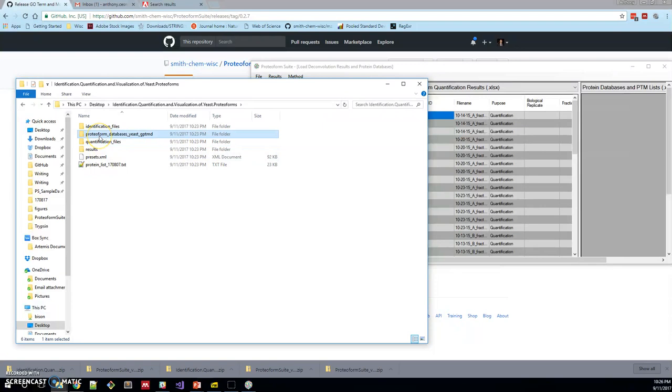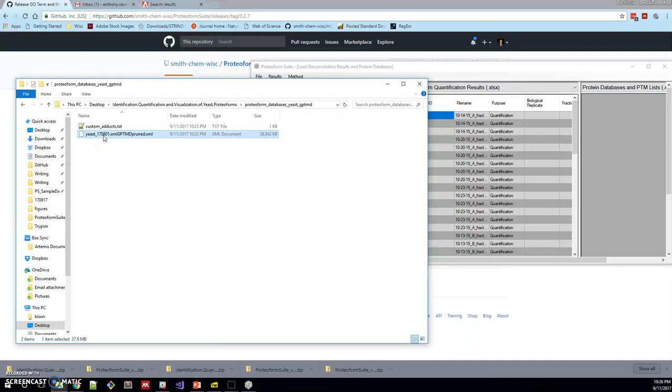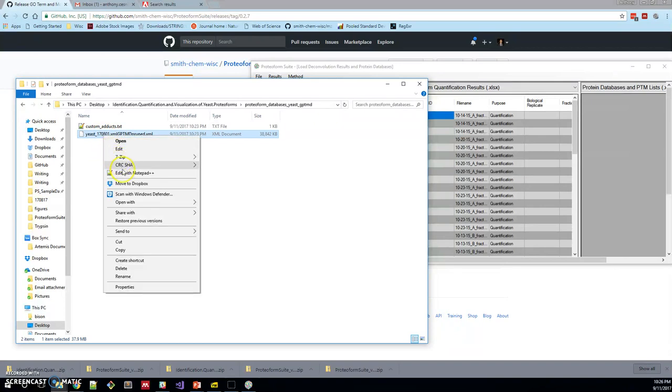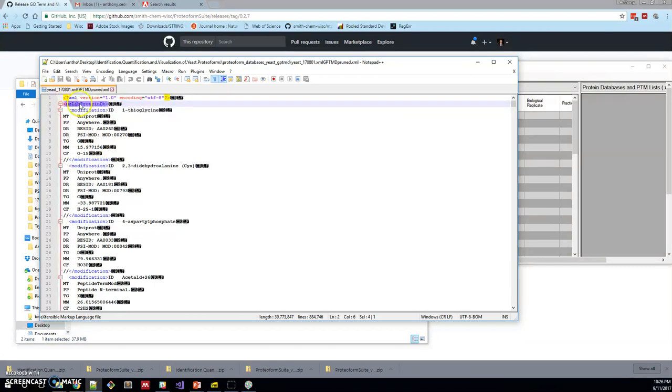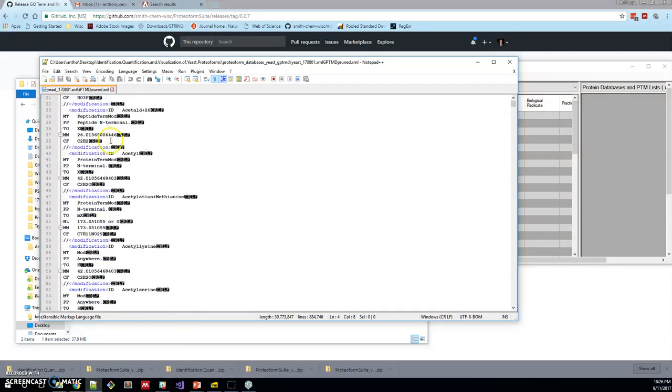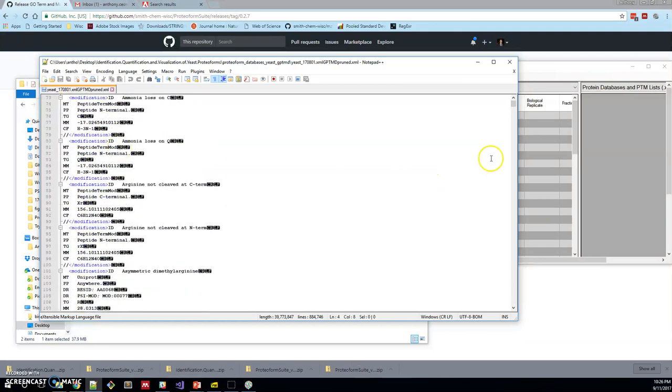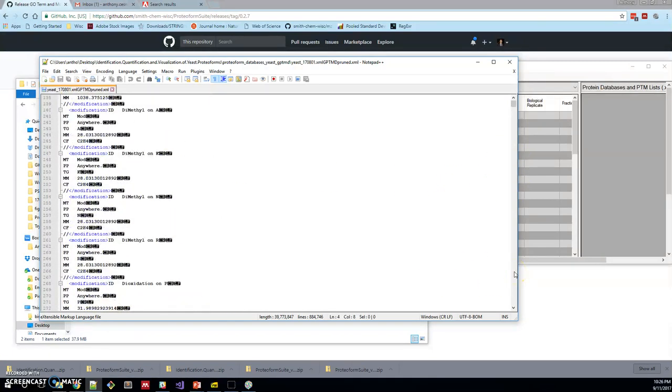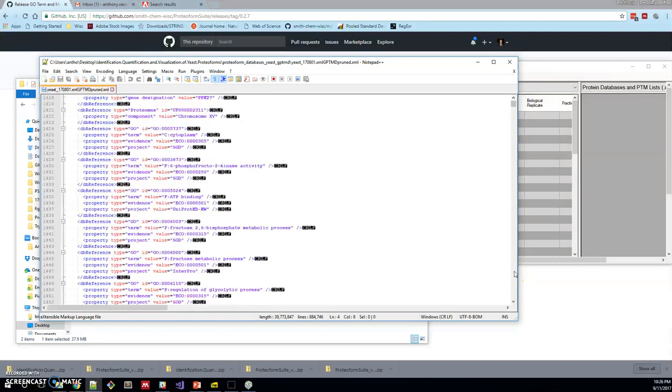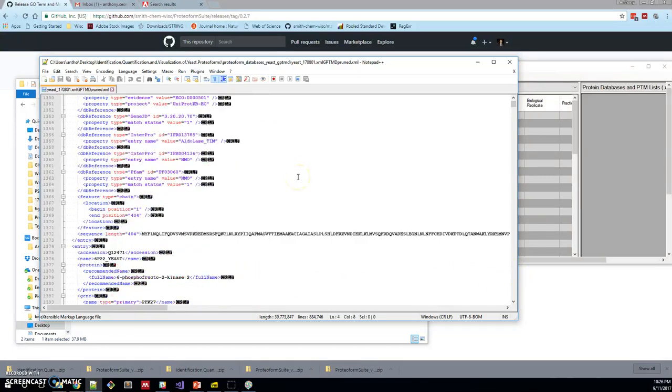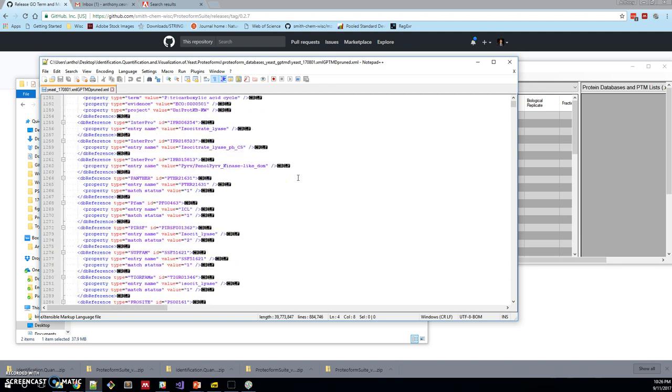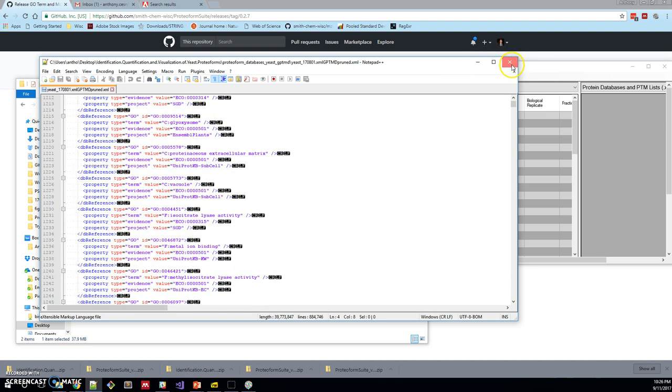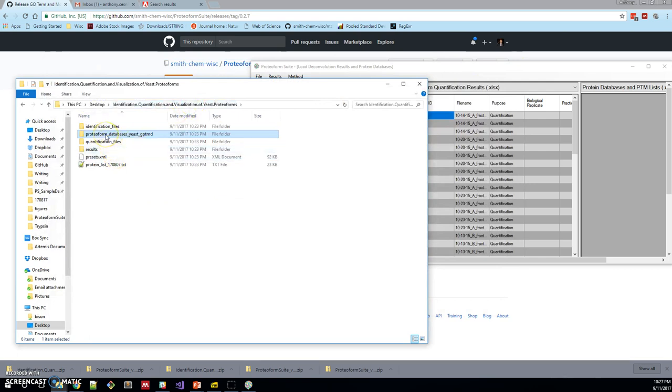Now we have protein databases. If you open this up, you can see that there's a Unimod-formatted database. We can just look at that quick. This is built with the package called mzlib that's open source and available from our lab. It contains modification entries up top so that those are portable, and then down below it has UniProt entries in XML format.